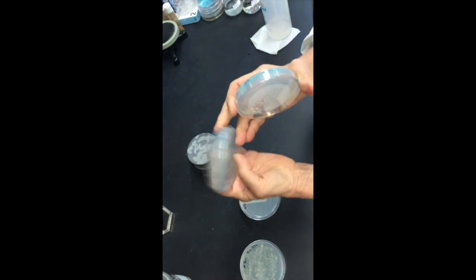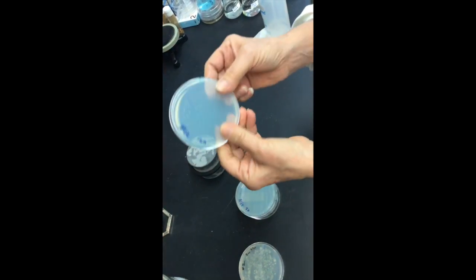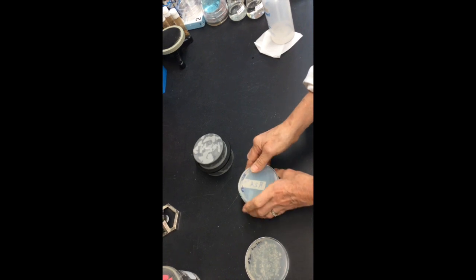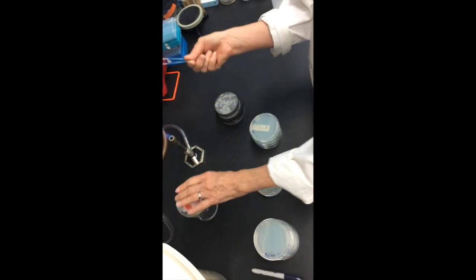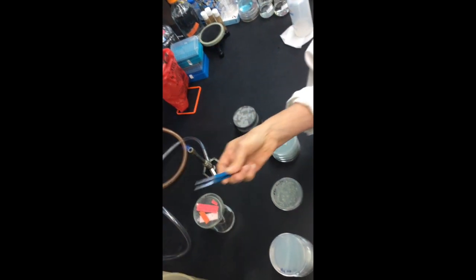We've got some plates that have 1 millimolar copper, we labeled them on the side, and then this one has 2 millimolar copper, and you can see that it's got a little bit of a bluish tinge due to the copper that we've added. To do a replica plating, it's very easy. We're going to take our forceps and dip it in alcohol and very briefly get the flame on the end, trying not to get it onto the plastic.